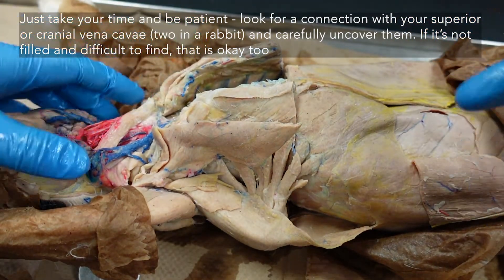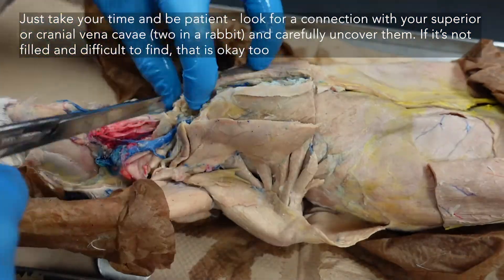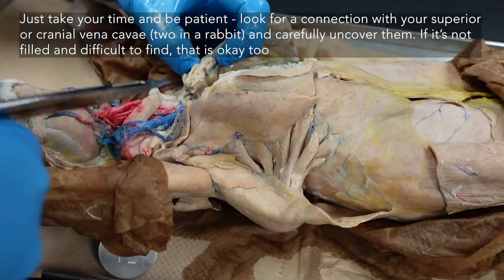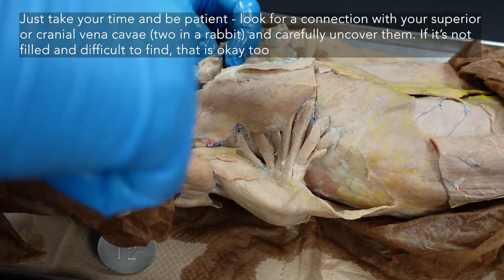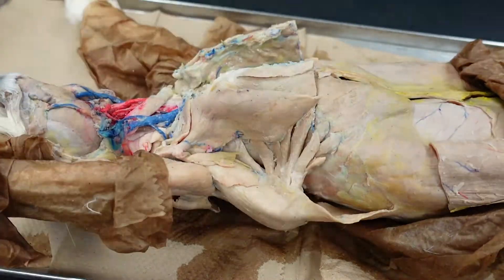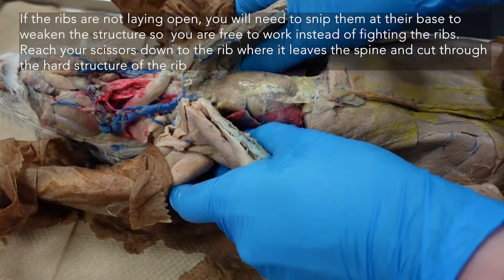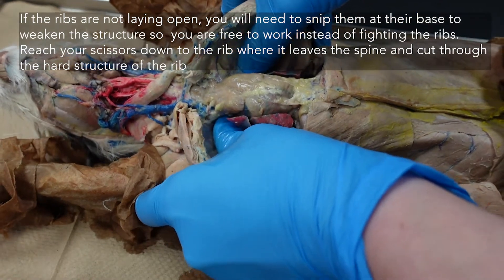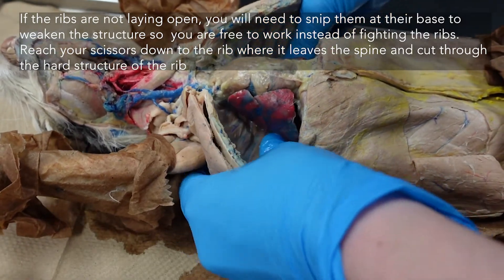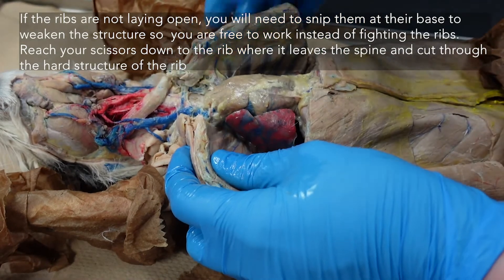This is probably the pickiest part of the whole operation. The ribs want to stay closed. What you can do to help mitigate that so you can actually see what you're looking at is reach down with your thumbs and sort of push at the top of the ribs to crack them a little bit. That will weaken their structure so the ribcage can stay open and you can actually look at your heart without trying to hold them open.